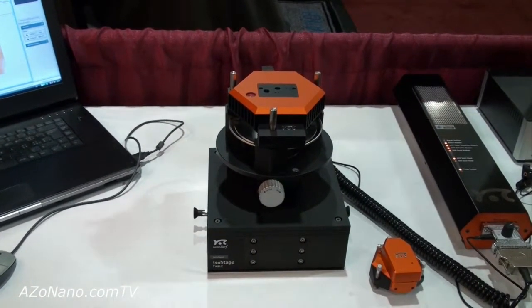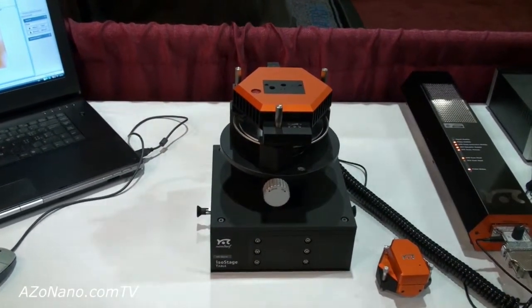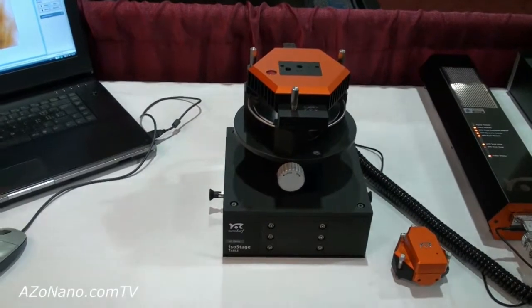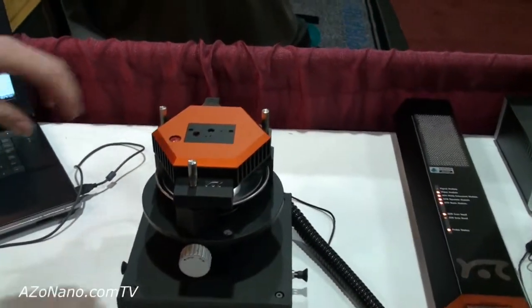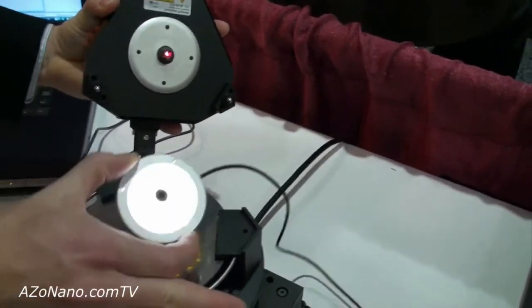Now we'll have a demonstration of how easy the NanoSurf EZscan 2 Flex AFM is to use. First of all, we'll demonstrate how easy it is to load a sample into the AFM.